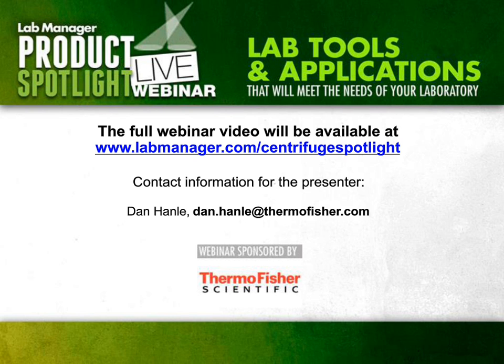We'll send our near final versions or final versions to that group, and we'll have them test it, and then they get a certificate. And that's really strongly how we rely upon those results. So when we make a claim or are able to say this thing's going to be something you can rely upon, we can. Having said that, that means that it's been cared for well, and most importantly, that means the O-ring.